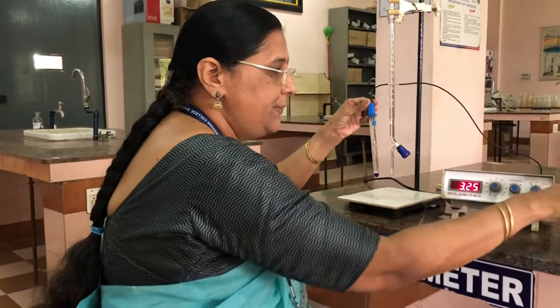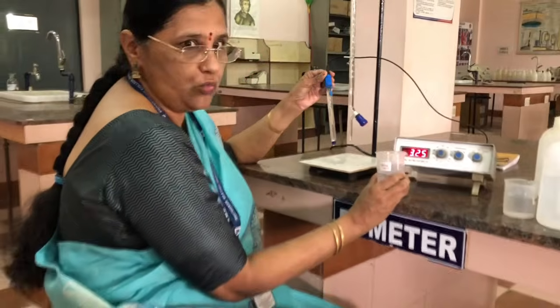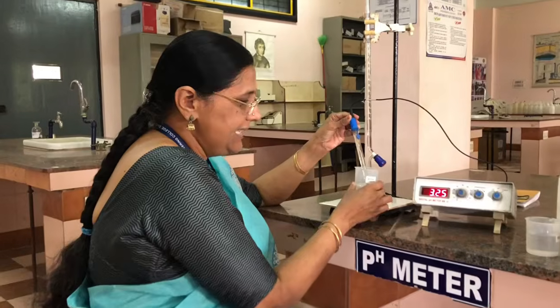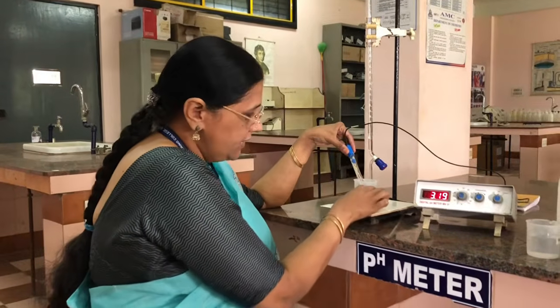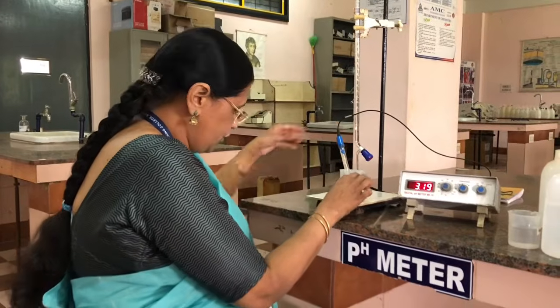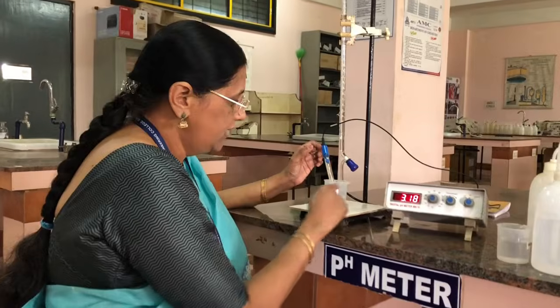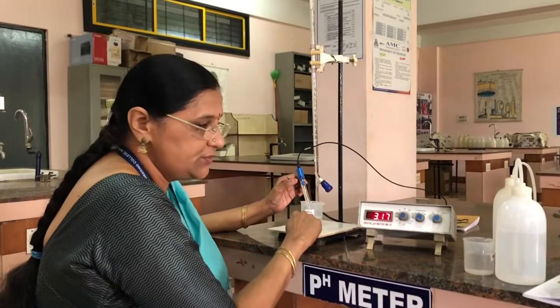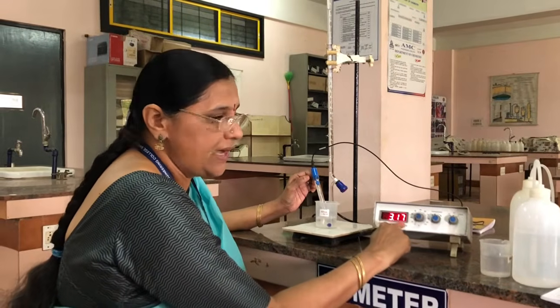Then we take a beaker containing weak acid, and we should not add any water into it, and simply dip the combined glass electrode in the weak acid solution. Now we switch on the instrument and it will display the pH of the solution. The pH of the acetic acid taken in the beaker is now showing as 3.17.